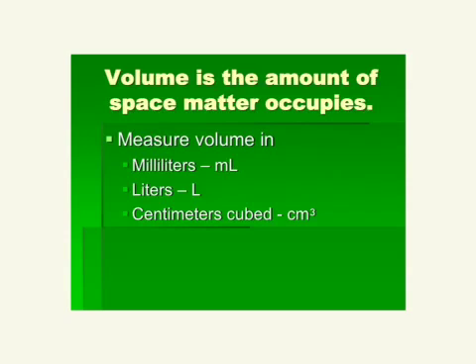So, volume is the amount of space matter occupies. Volume, it's how much space it takes up, okay? We measure volume normally in milliliters in our classroom. So that's a little m, big L. We also measure it in liters, like you guys know a 2 liter of pop, right? Or a liter of pop even. And that is a big capital L.